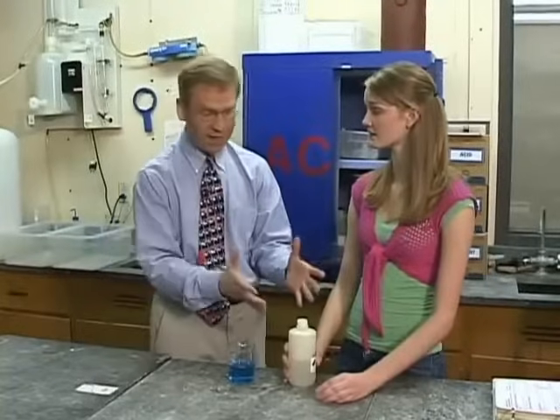Never perform any unauthorized experiments or take chemicals from a stockroom or from a lab. Never work alone and never work without your teacher's permission. We want you to be safe.